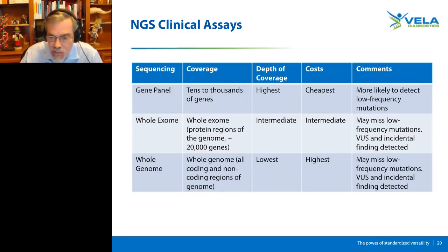As the cost of sequencing and analysis drops, and as the databases get better, whole exome and whole genome will certainly be considered tests of the future. For routine testing, gene panels will dominate the market for the time to come. And even if the gene panels turn up negative, there usually is enough tissue to generate another, larger panel. Remember, you only need about 10 nanograms of FFPE DNA to run a gene panel.